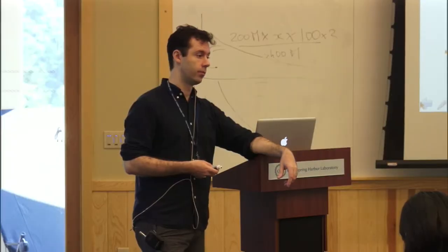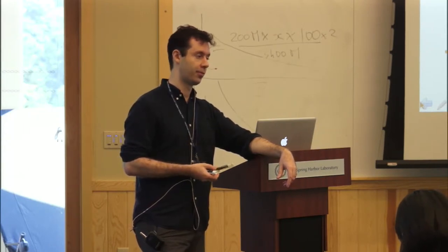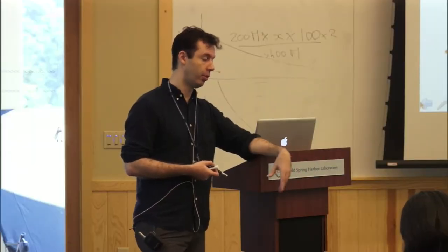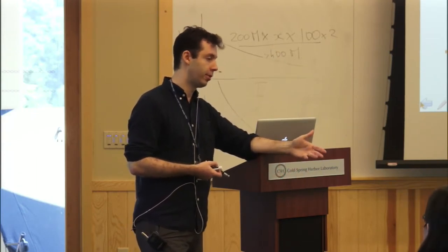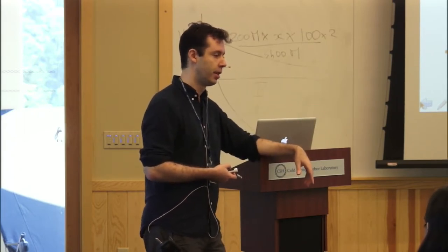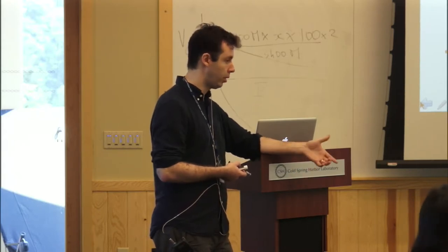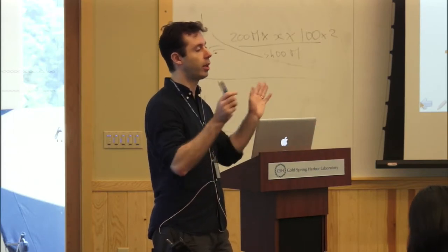So when you map the reads, sometimes the reads would map to multiple places. So you just drop them? Good question. There are multiple ways to answer this. A lot of people just drop them. Most of the time it's fine because you have so many of them anyway, so yes, you lose a few reads and it's not a big deal. There are people who, when you have a read that maps to a limited number of locations, keep the read, and you can do two things. Let's say that you have a read that maps to 10 locations equally well.